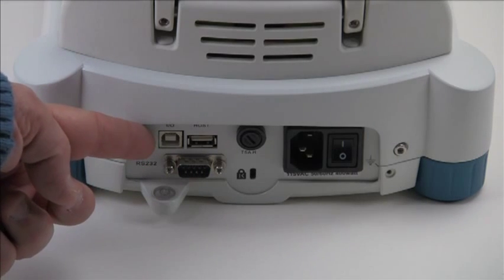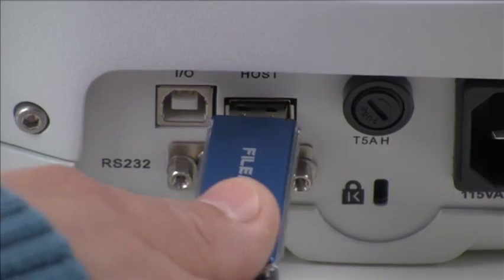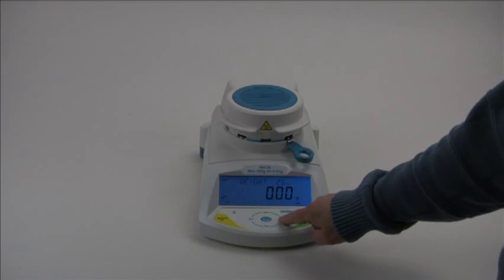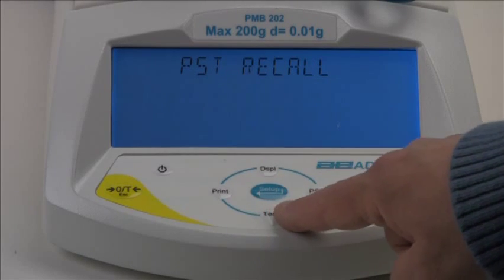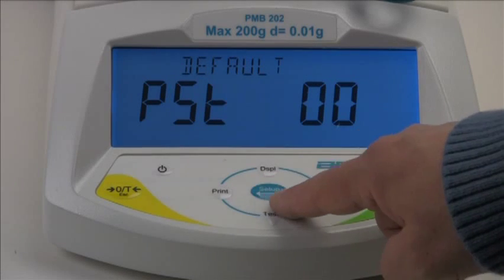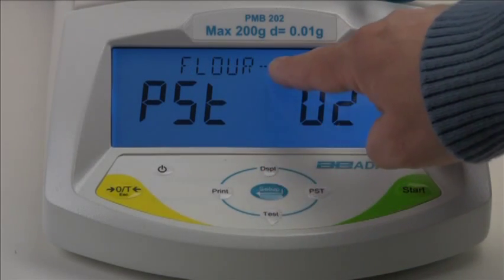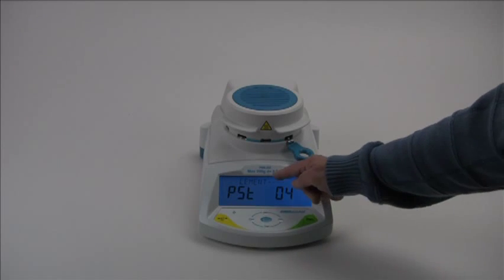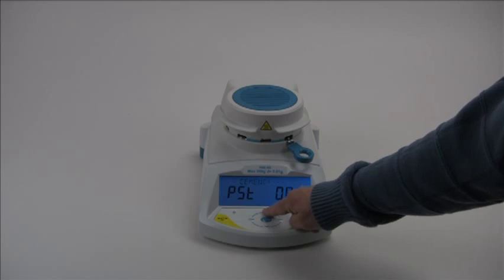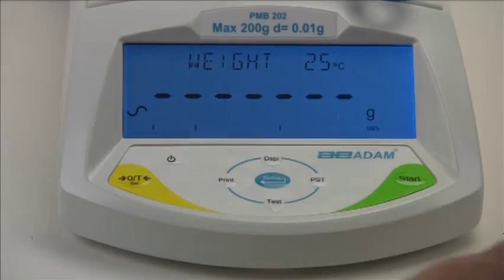Adam's PMB allows you to quickly store and recall test routines and results for many different products. Now let's go through a simple moisture test to demonstrate how easy it can be to get results with the PMB.